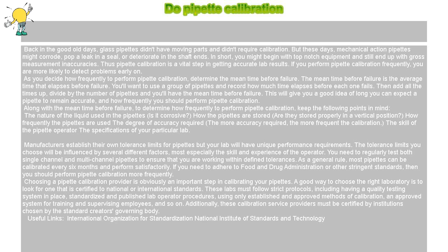Manufacturers establish their own tolerance limits for pipettes, but your lab will have unique performance requirements. The tolerance limits you choose will be influenced by several different factors, most especially the skill and experience of the operator. You need to regularly test both single-channel and multi-channel pipettes to ensure that you are working within defined tolerances.